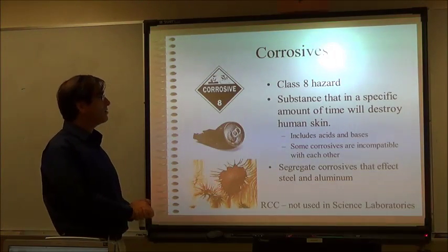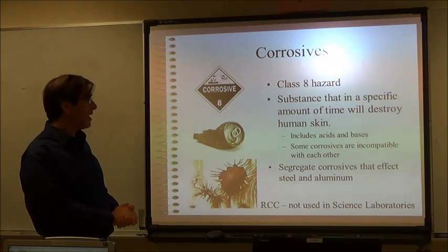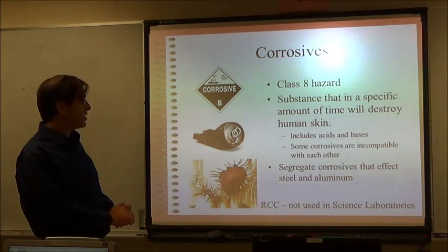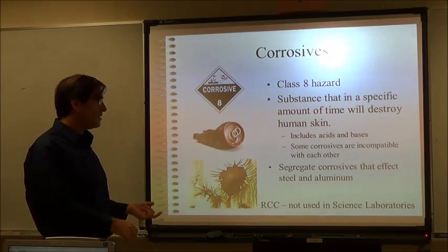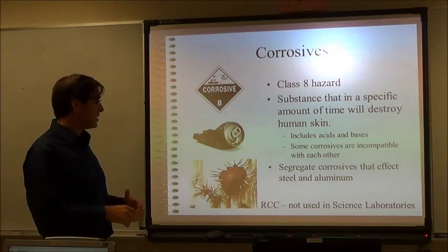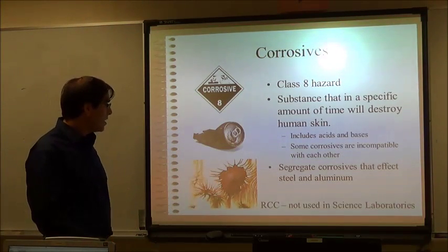Class 8 hazard is corrosive substances. These are substances that, at a specific amount and in time, will destroy human skin. These include both acids and bases, and some corrosives are incompatible with each other, so you need to keep them isolated, and you don't want to necessarily mix them.